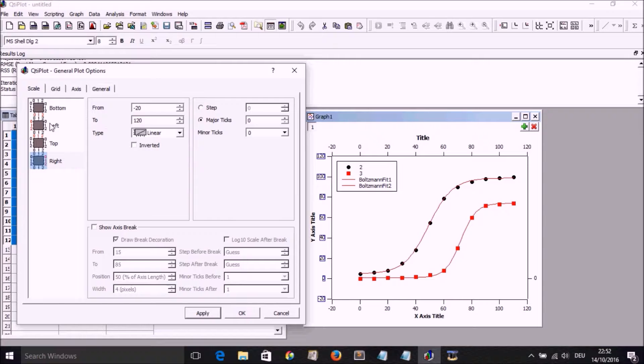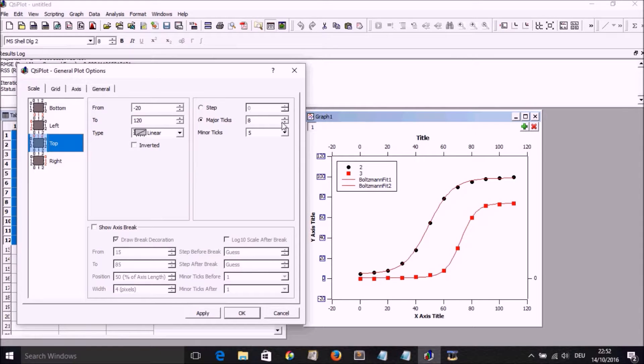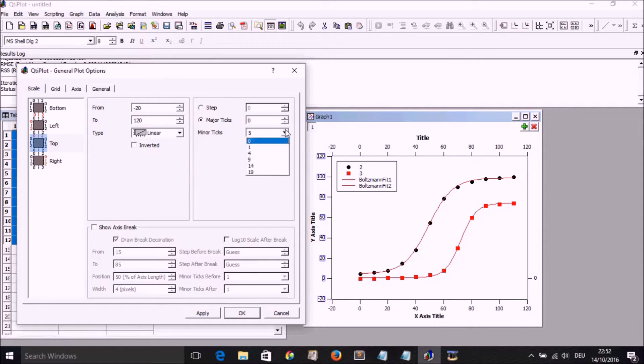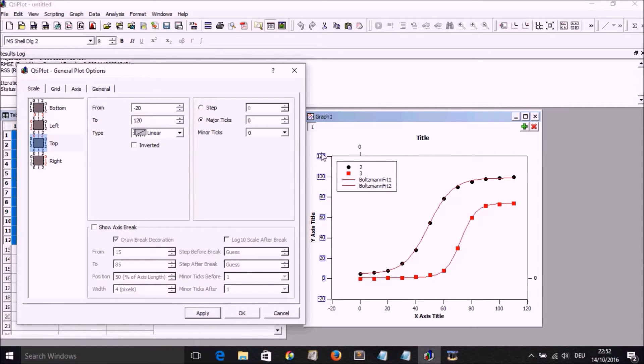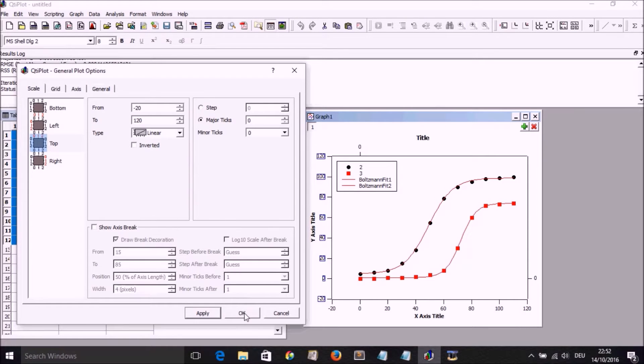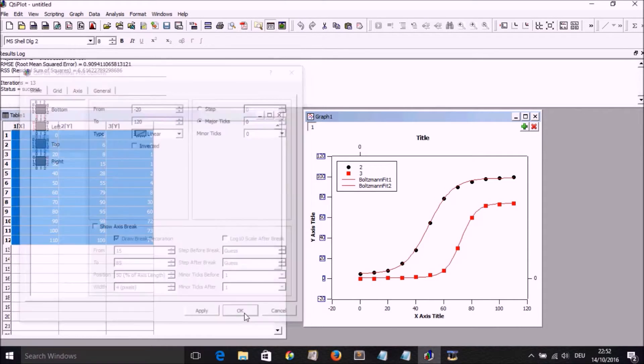Same like with the upper axis, the top axis, we put zero there for both minor and major and select apply. So we now have our fit sitting in that box. We select OK.